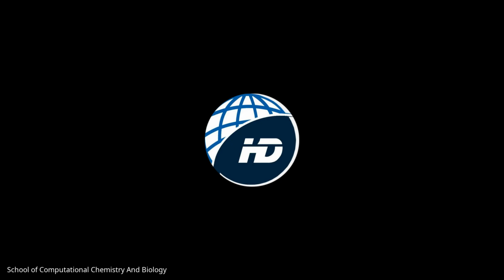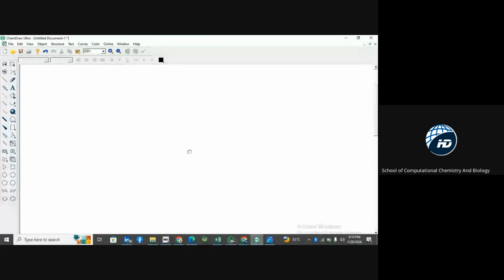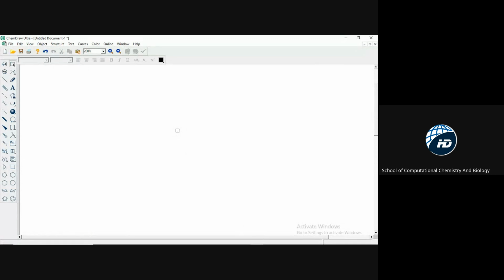So we have a question from the previous session yesterday. If there is none, I can proceed. Let me quickly share my screen. Okay, can you see my screen? Yes, sir.